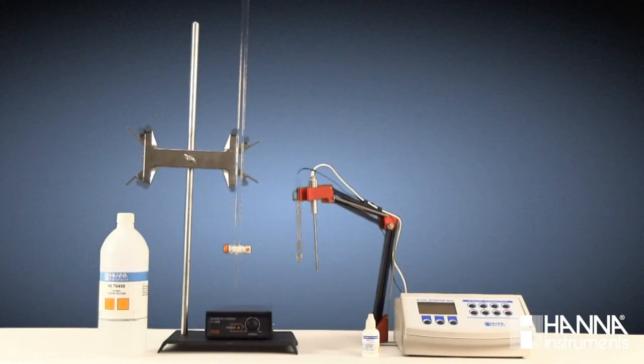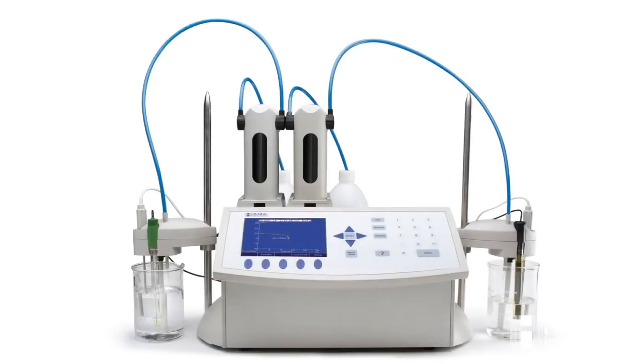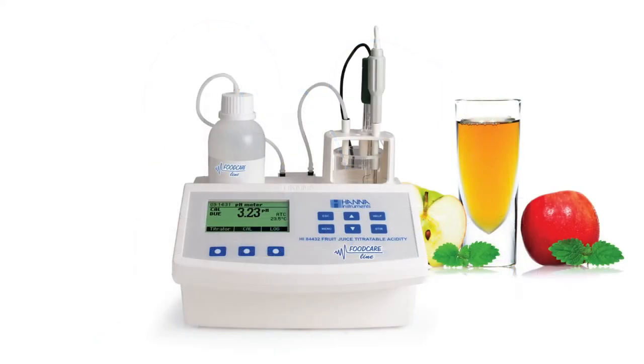In addition to pH meters and electrodes for manual titration, HANA also manufactures automatic titration systems, including our research-grade potentiometric titrator, the HI-902C, as well as an industry-specific line of mini-titrators, which includes the HI-84432, the mini-titrator for acidity in fruit juice.